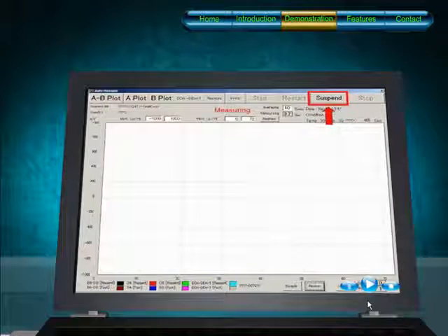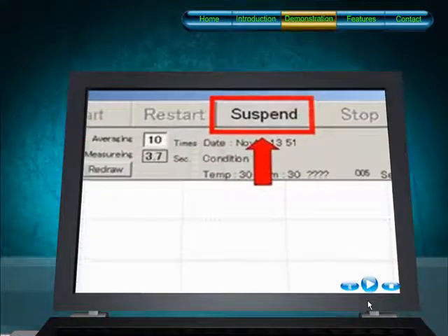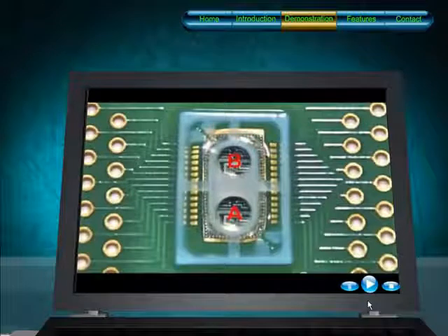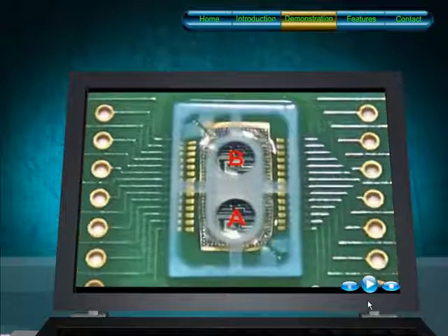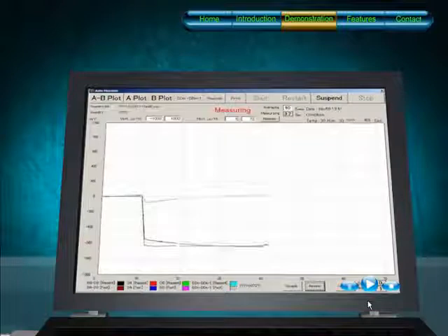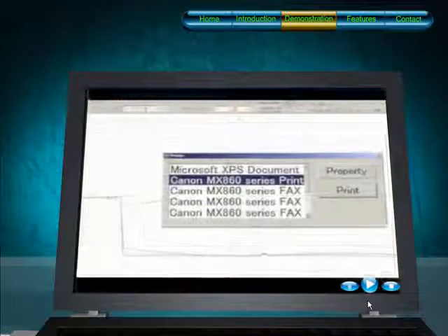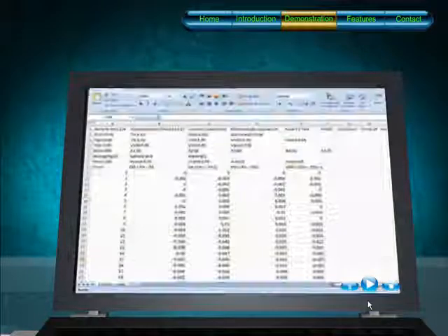We suspend the operation in order to introduce the sample. Typically, inner cell A is used for the sample while the outer cell B is for control. Sampling measurement shall now begin. The readout can be printed for record purposes.